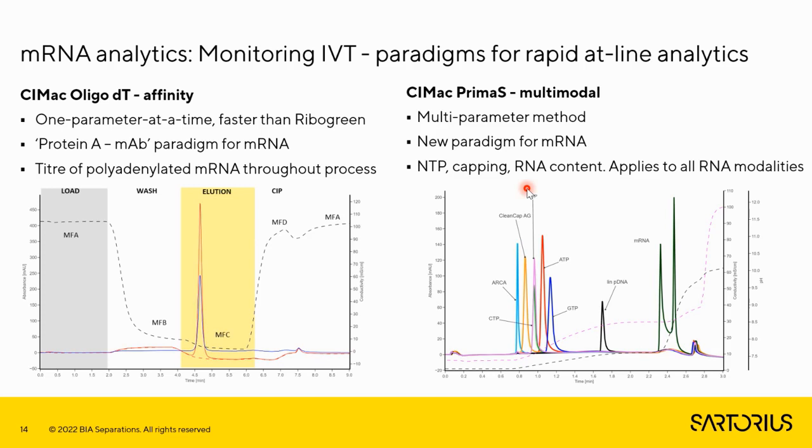And so we want to know at any point in time of the reaction, what is the concentration of our building blocks, so that we can ensure that our reaction is proceeding seamlessly. If we run out of one building block, the whole chain elongation will stop. And so we developed this very rapid analytical method with the runtime, or I should say for clarity, the resolution time on the method is 3 minutes, which is relatively very short in the time scale of the reaction, which I said is between 2 to 3 hours.